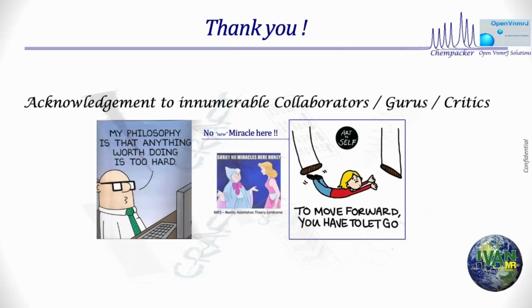But then we say that we have a truncated FID. Our thought process is, how am I going to get around it? How am I going to add a process to it so that I don't have the truncation artifacts? How am I going to add something else so that I will improve it? Perhaps we shouldn't do that. Perhaps we are willing to give up fidelity in one process. I'm just saying, 8x dilution is perfectly okay. Is that the limit? I don't know. That is within the fidelity of Bayesian that I have. I am sorry, I'm just a chemist.